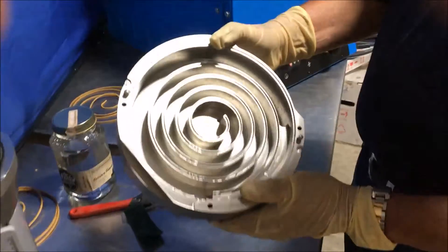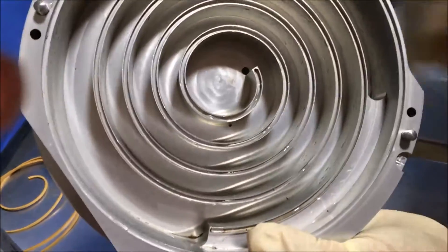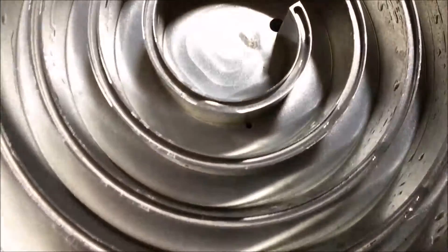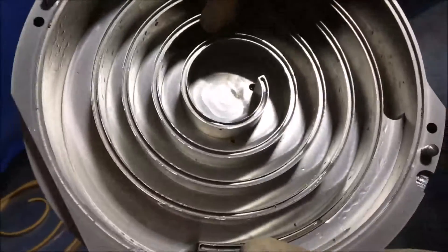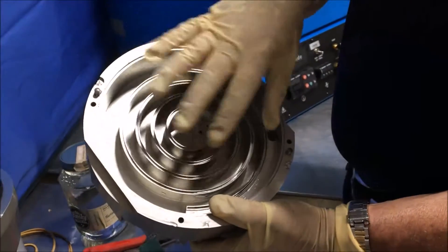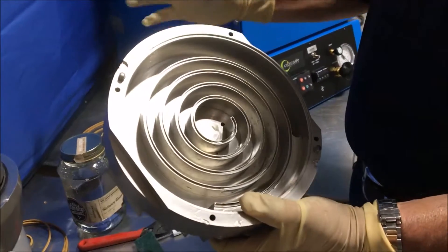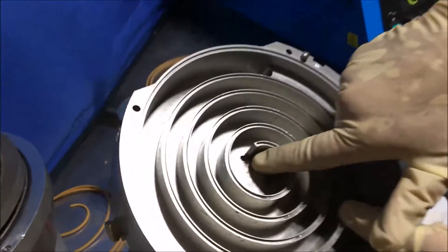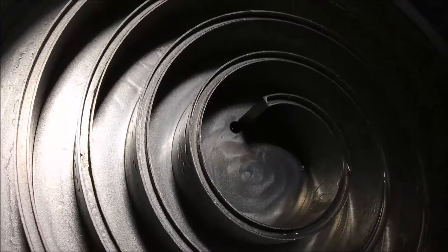Looking at this scroll, you can see a small hole at the root of the scroll here. That's where the gas ballast allows a little bit of atmospheric air to be brought in during the final stage of compression, so that we can elevate the temperature of the pump and keep solids from forming inside the pump and get them through to the exhaust. This hole here is the exhaust port that allows the gases to exit to the exhaust.